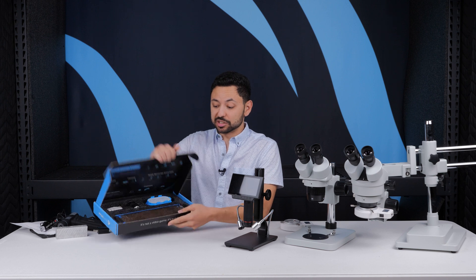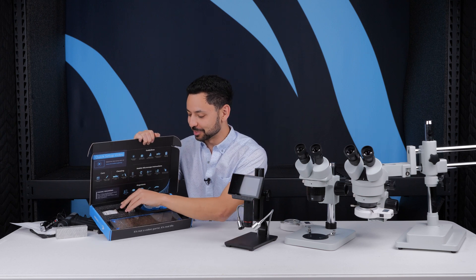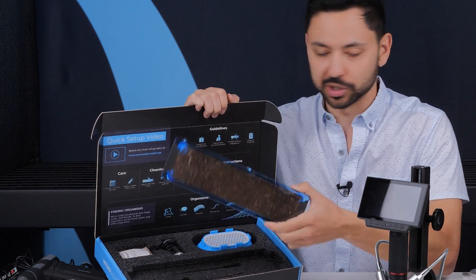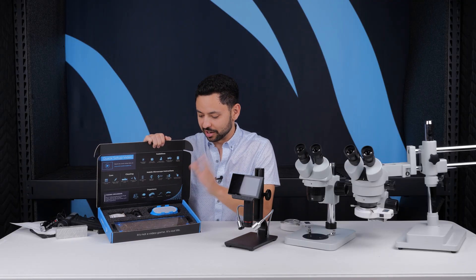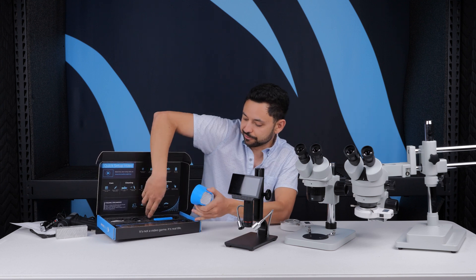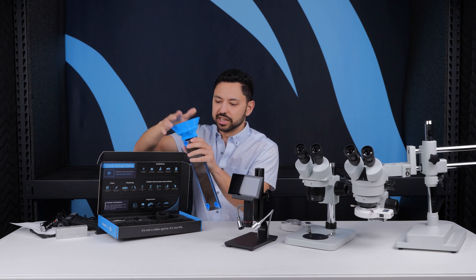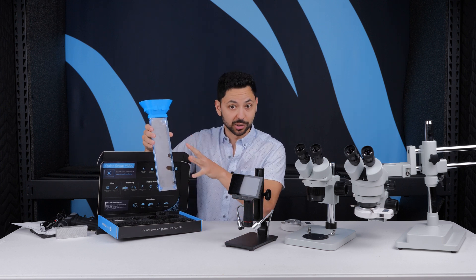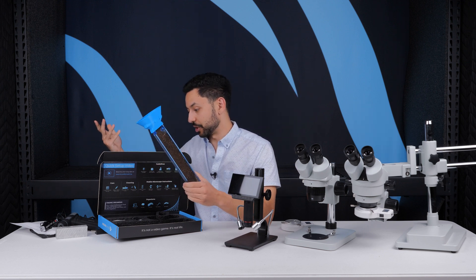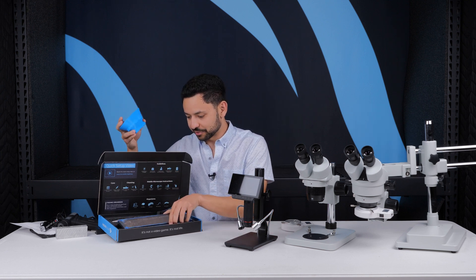In selling our MicroSafari kit, I hear tons of parents saying the kit is awesome and the kids love it, but really the thing they go crazy for is just the smartphone microscope. By the way, this is basically a giant microscope slide filled with live soil organisms, so you can have your own little universe of creatures that you can feed and take care of. This is actually the new version—the fill-it-yourself version—where you take this little funnel, put it on the top, and fill it up with soils from your own backyard to explore different organisms and ecosystems. This works with all of the microscopes I've shown thus far; it just requires a reflected light illumination source. Kids love this thing.